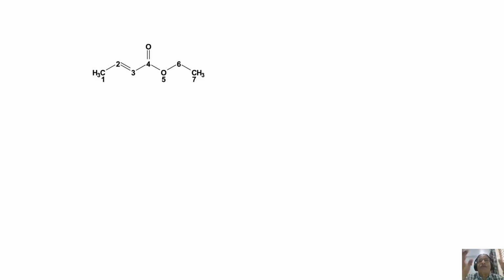You cannot take a simple molecule, for example a molecule of this size, which has 1, 2, 3, 4, 5 different types of protons present, and then just say, just because the molecule is available and the spectrometer is available for me, I will go and record the 800 megahertz spectrum, I will record two-dimensional, I will record 3D NMR. What is the need for that?